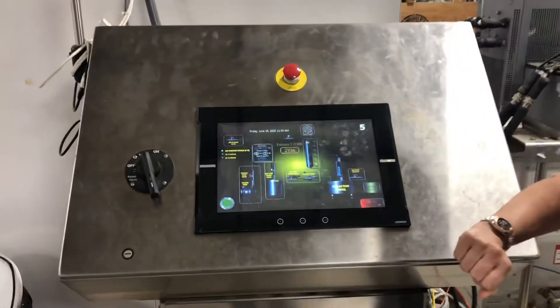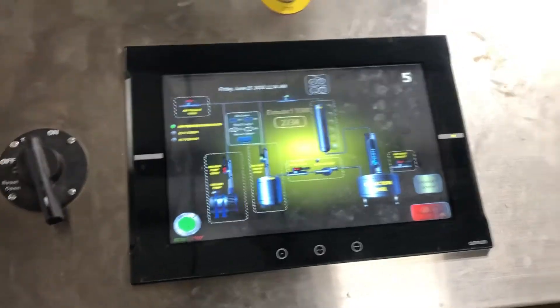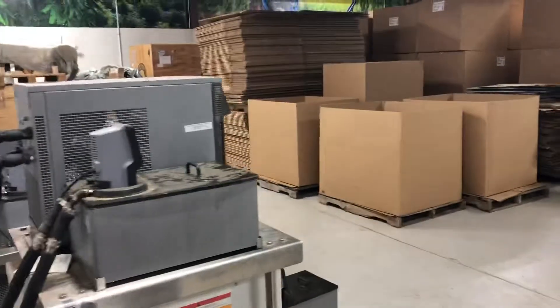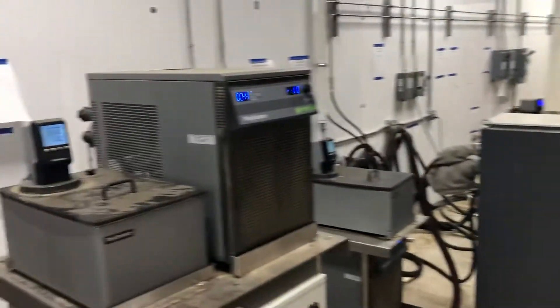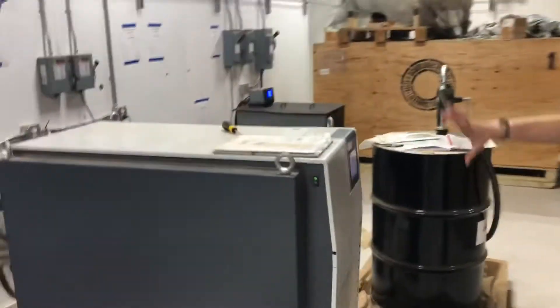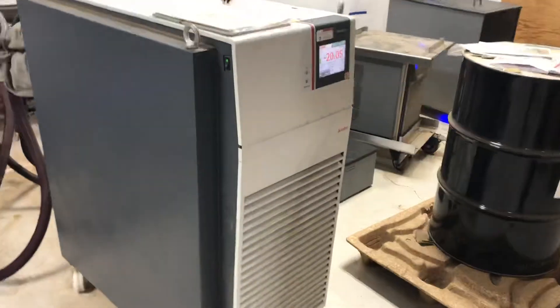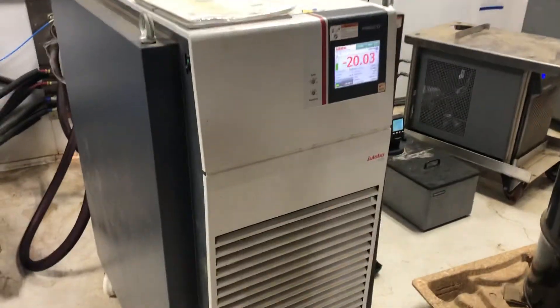We're working on tube six right there. You can see we've done a lot of experimentation, but auxiliary components work the best. We started off using these polyscience heaters and chillers, then moved to more robust chillers so that the jalabo units get down to much colder temperatures. The colder you run, the fewer extraneous things you're going to pull out of the plant and the less filtering you'll have to do in winterization.